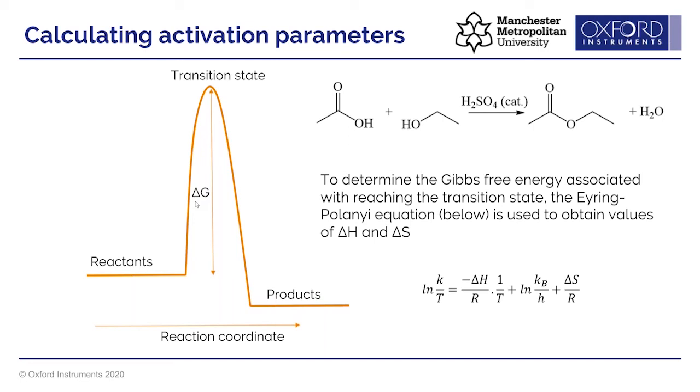In practice, what we need to do is do the same reaction using the same amounts at different temperatures. Because I've got a round bottom flask, maybe fitted with a reflux condenser, and underneath it a stirrer hot plate, I can easily modulate the temperature, monitor that using a thermometer, and make sure that I've got good control over my system. So this is what I did.